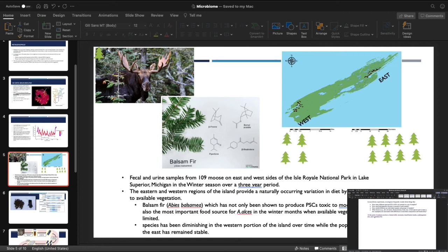So a metadata file is basically just like all the history about each sample. The metadata file has when the sample was collected, what the animal was eating at the time, the animal's age, whether it was a male or a female, whether it was a juvenile or an adult. So it's just back history on the samples, which you can use in your analysis to test what factors are causing changes in the diversity. So we're going to start here.